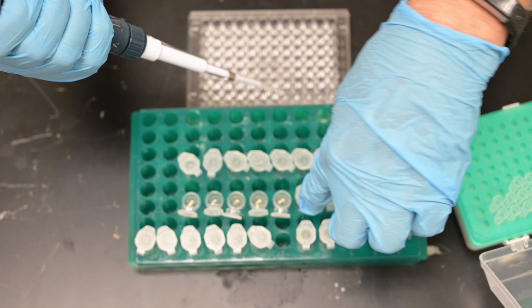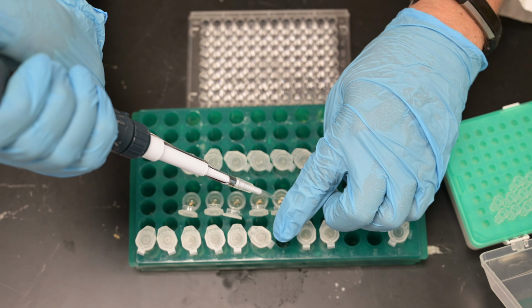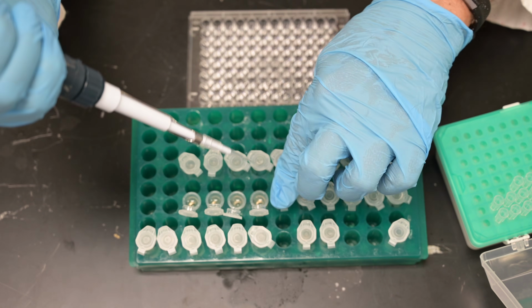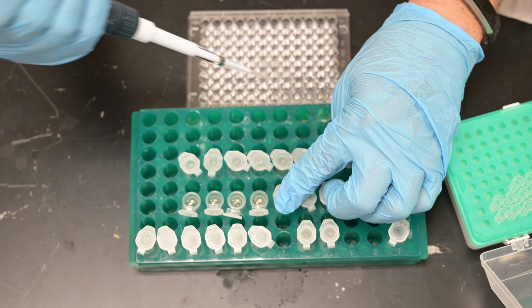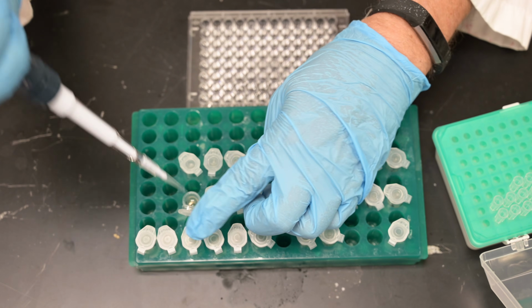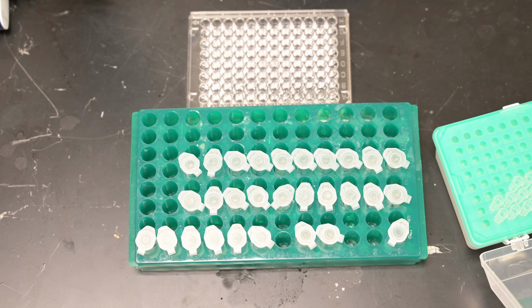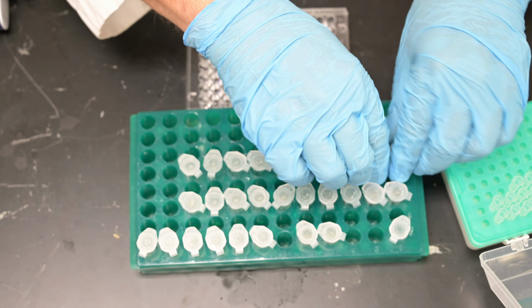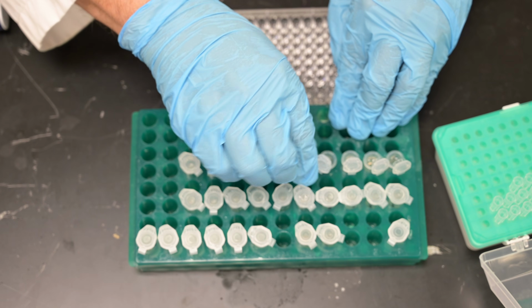So I just loaded wash number 5 into B5. Now it's tube number 1 from the 0.1 molar elution, so that goes into 6, 9, and 10. Next, I'll pop the caps for these samples for the next row.